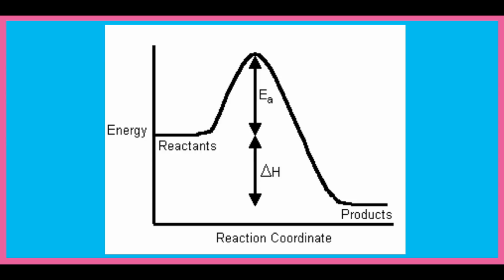When we carry out the reaction, which we will see in a moment, you will notice a bright white light forming. Remember that light is a form of energy. If light is released during a chemical reaction, that means the molecules that are reacting are releasing energy, and we have an exothermic reaction.